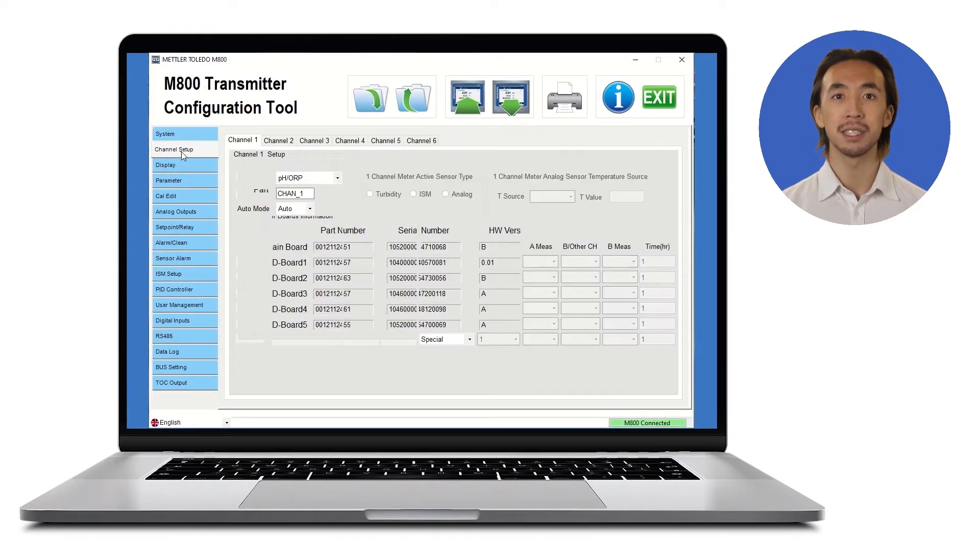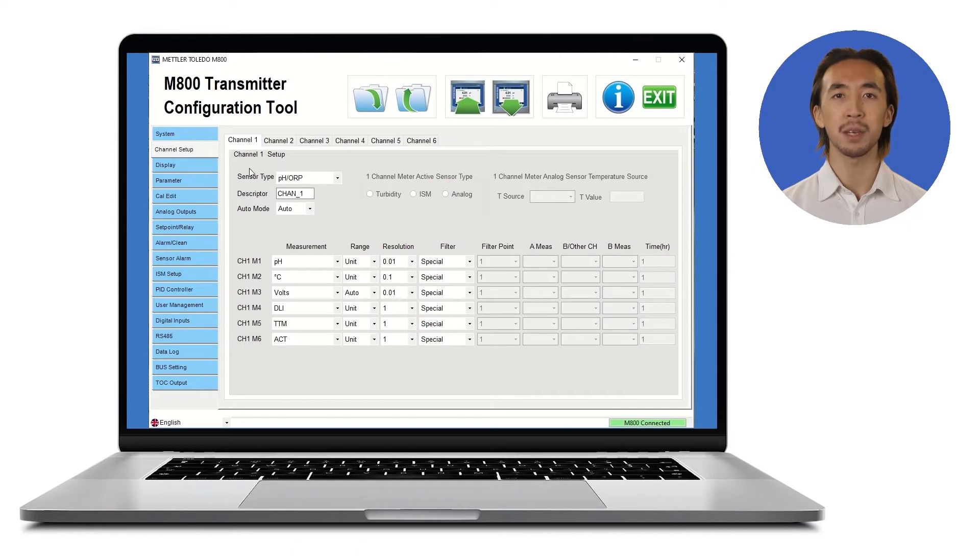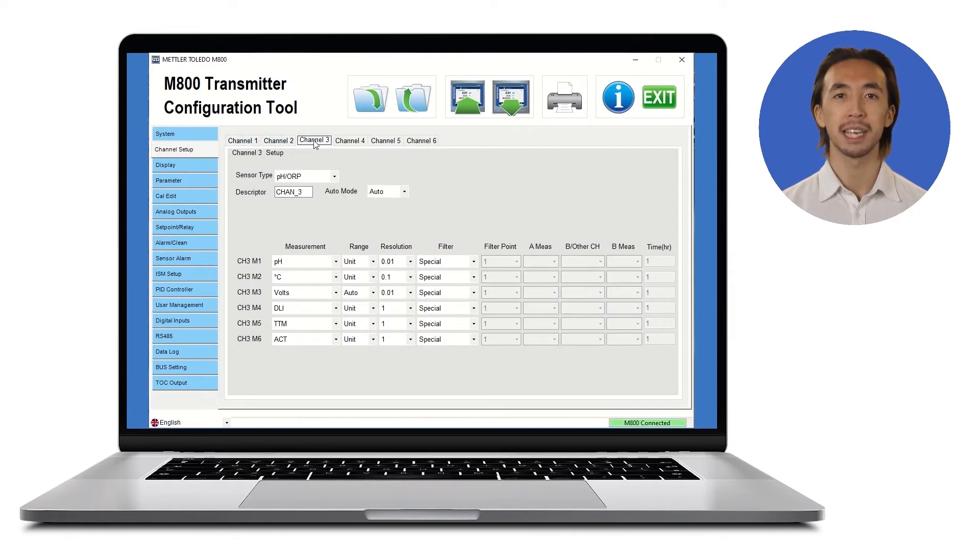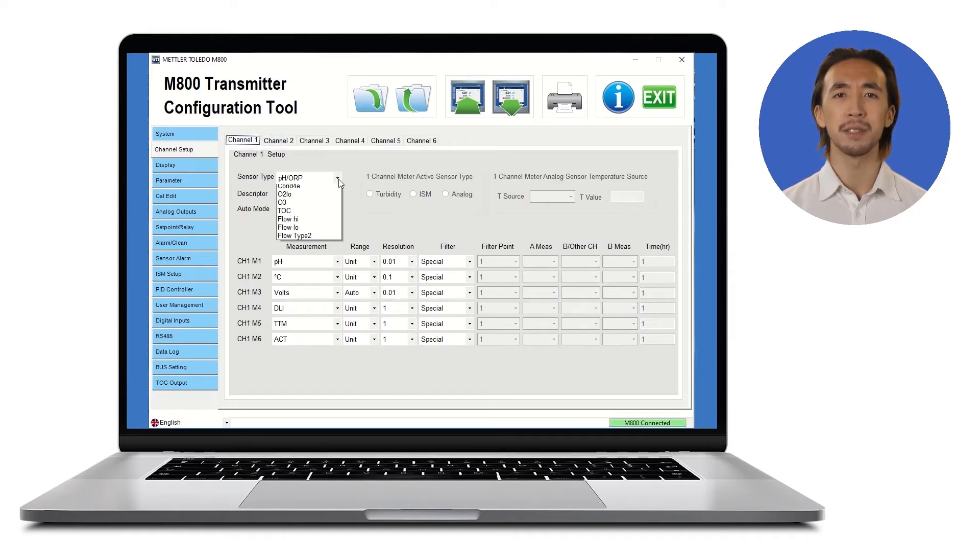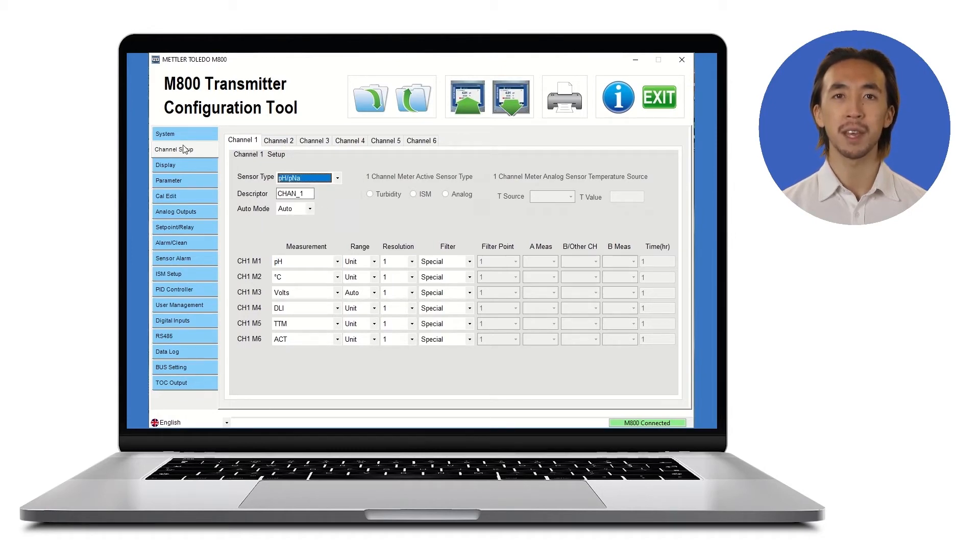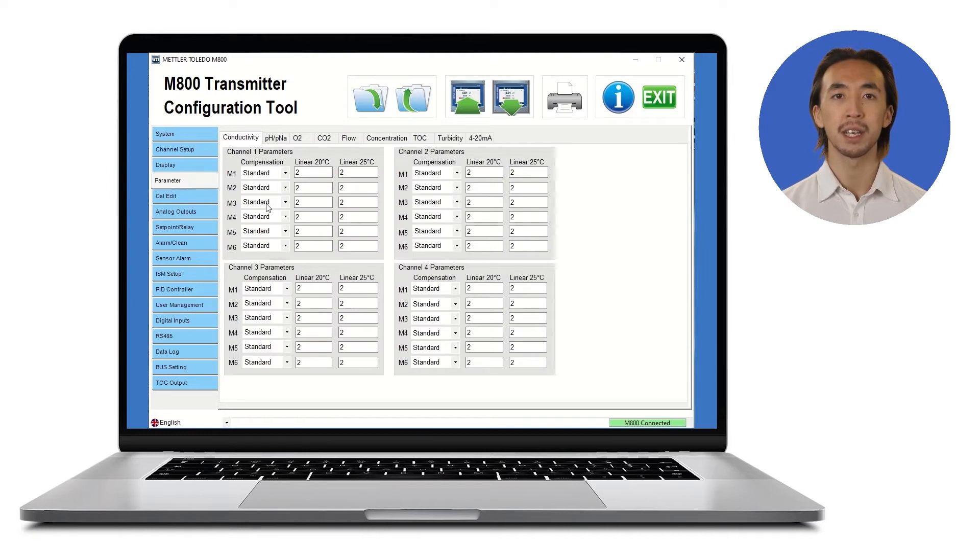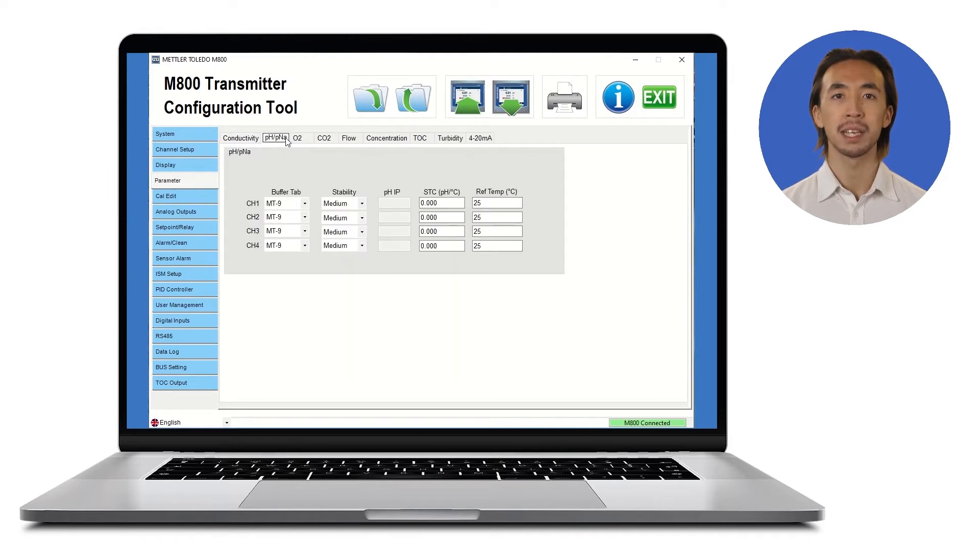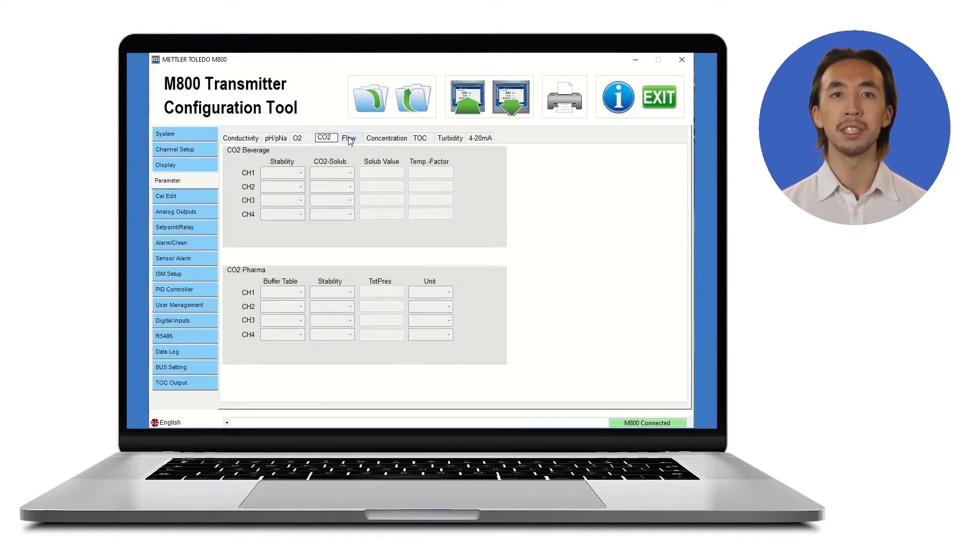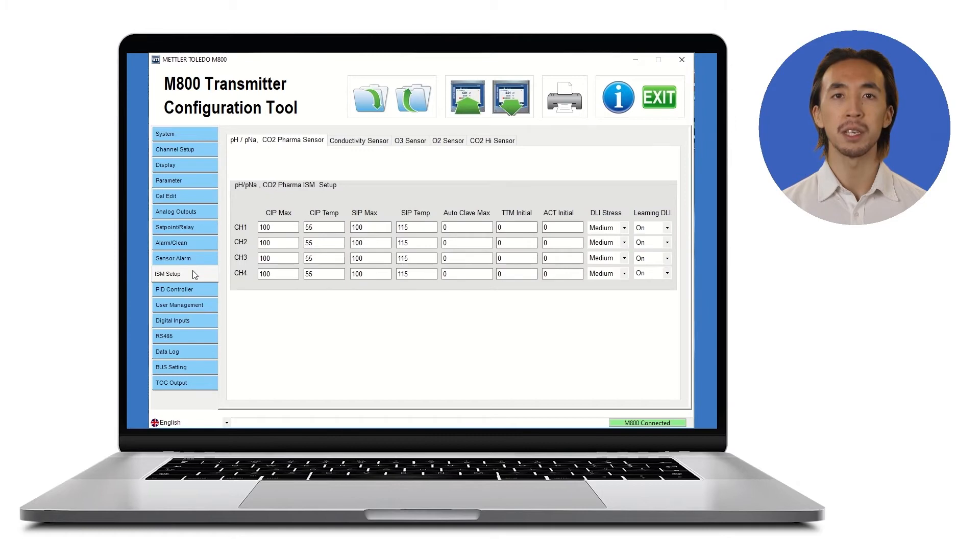By using the TCT tool, you can conveniently set up your measurement parameters by channel, display units and resolutions, and define filter types for all values. Define your parameter details, for example pH calibration buffer sets, temperature compensation, and much more.